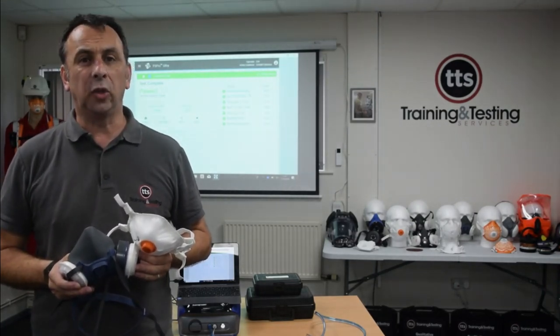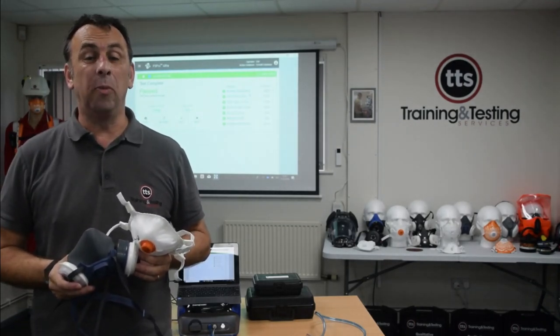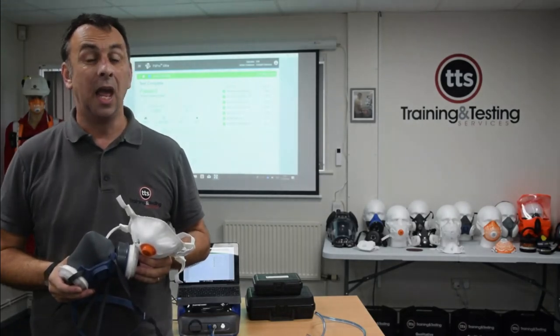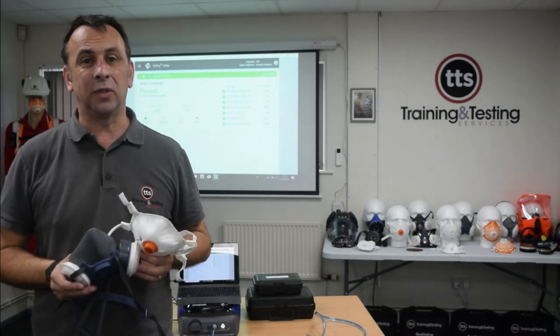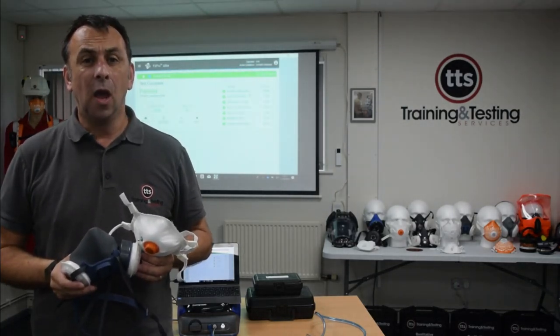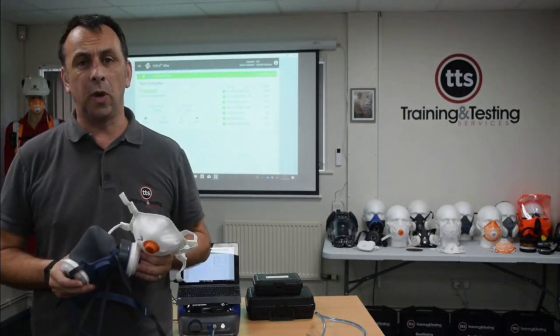Now, a little bit of facial hair doesn't necessarily mean that the test will fail. But as we can see, a little bit of facial hair greatly reduces the level of protection that you guys are getting. And this is actually the whole point to this. This is why the Health and Safety Executive say that we have to be clean shaven in order to wear a tight fitting mask. If we are not clean shaven, we greatly reduce the level of protection that we are going to receive.